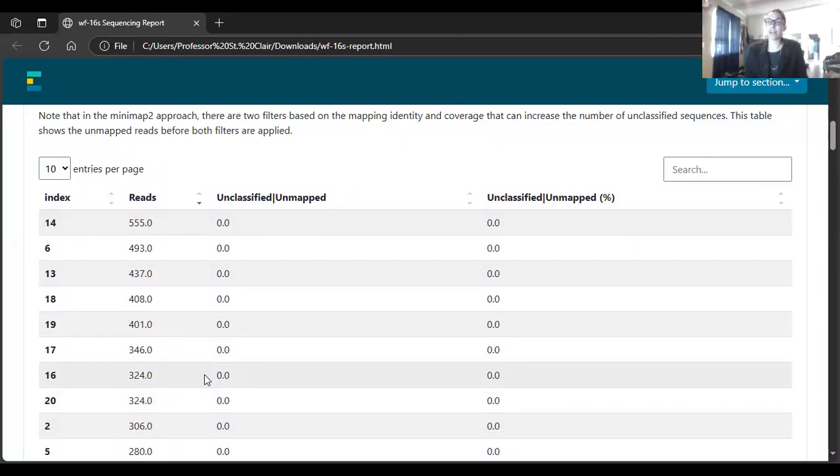And I found that out of those 7, 3 of them were from the plastic plots. So I got a little bit of a sense, which was consistent with our artichokes data, that the plastic treatment tended to have the higher abundance of bacteria in general, not taking into account what kind of bacteria, just that they had the highest number of reads.